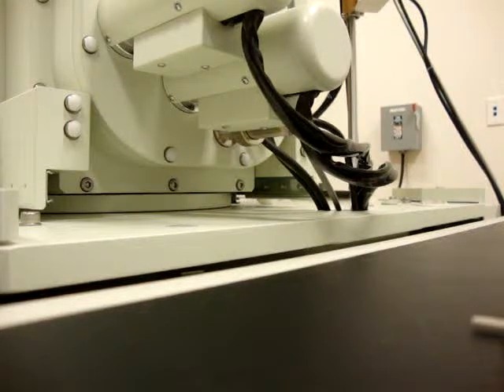Something's blinking. What's blinking, Mirza? Oh, it's the photo, because I'm still typing. It says photo. Ah, the photo is blinking. So you could have taken the picture just by hitting the photo button. Okay. One second, control X. You have to remember where you put it. I'm just putting it on the desktop.